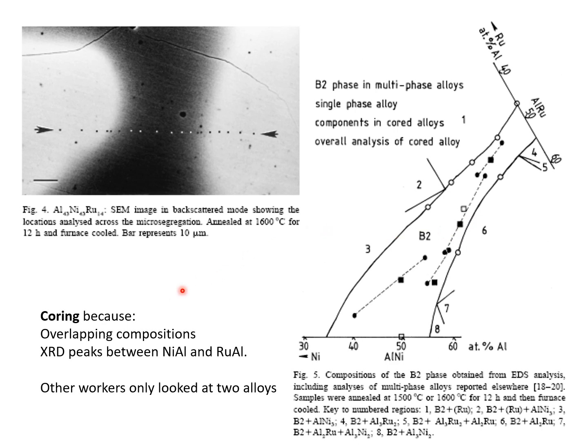We also had overlap. This is the overlapping compositions. We also had X-ray diffraction peaks of both of them, and they were very well. They had two separate X-ray diffraction peaks, but they were both very broad. Okay.